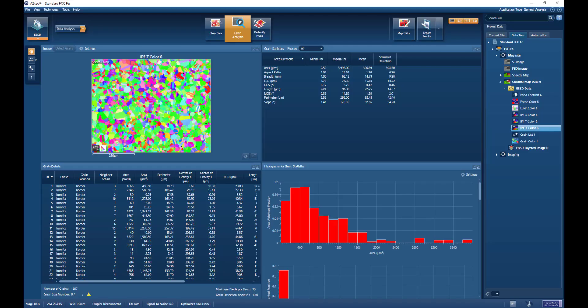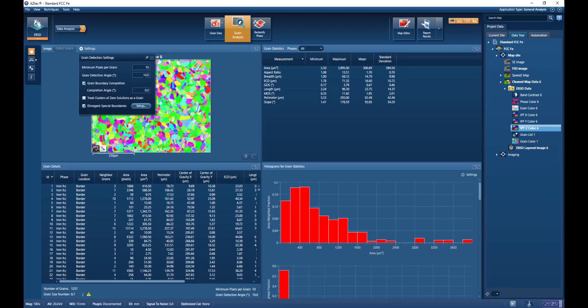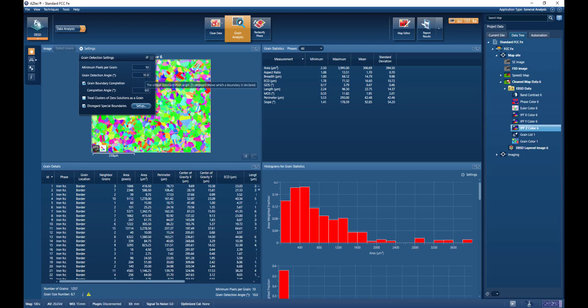So if we switch back to Aztec and go back to the settings, a typical default grain detection angle would be somewhere around about 10 degrees. But in some materials we might use a little bit lower than that, perhaps down to 5 or 7.5 degrees.